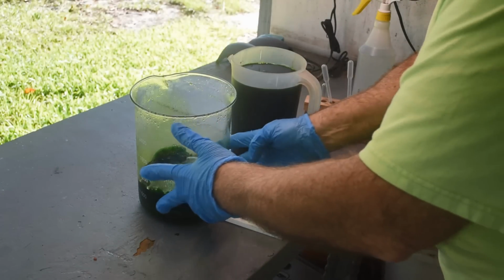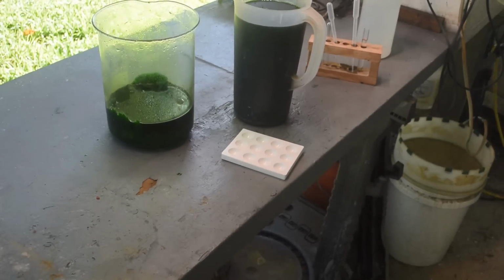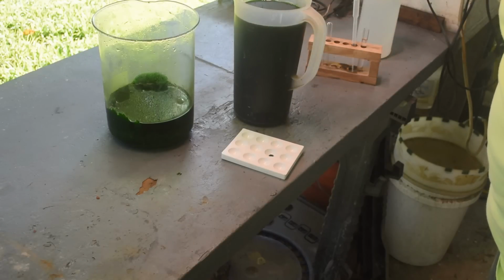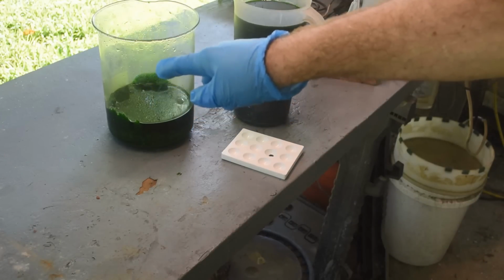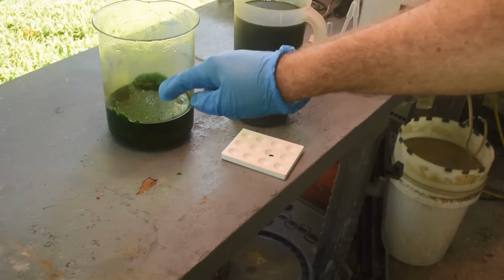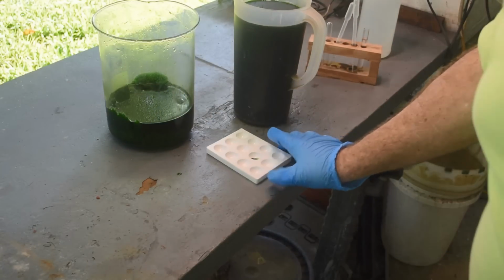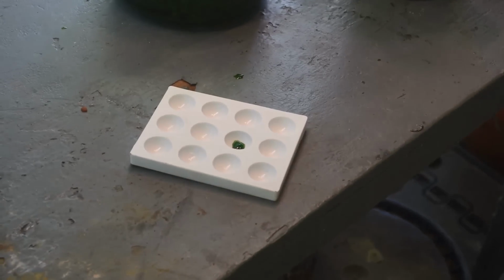Okay. Let's do a stannous chloride test on this stuff and see if we still got palladium in this stuff, or if I'm leaving it behind as a chloride in there. I don't know how dilute this liquid is. If there's still a lot of hydrogen chloride in it, then the palladium's still in solution. But if I got rid of most of the hydrogen chloride, the palladium might have dropped out of solution. So we'll see. Let me put some stannous chloride on this.